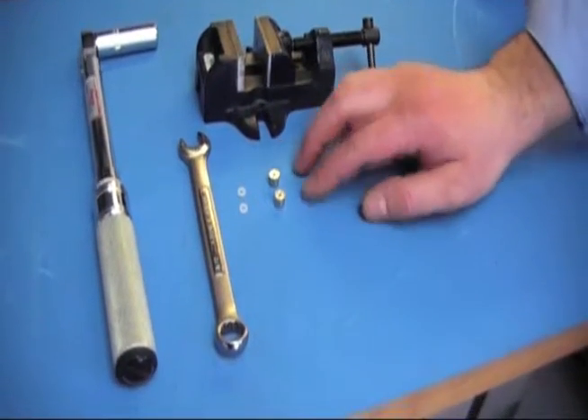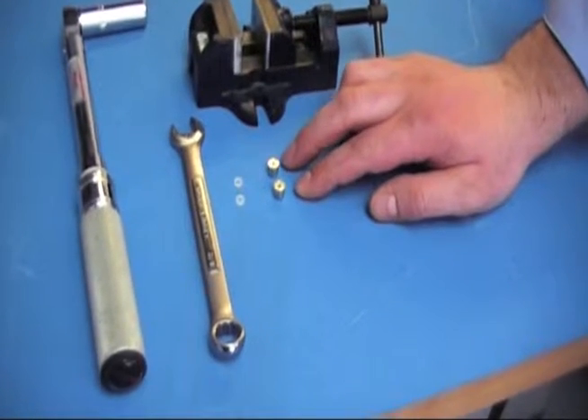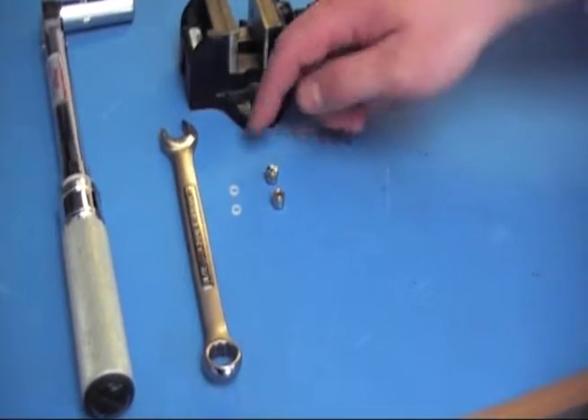The materials you need are just the check valves and the check valve seals.